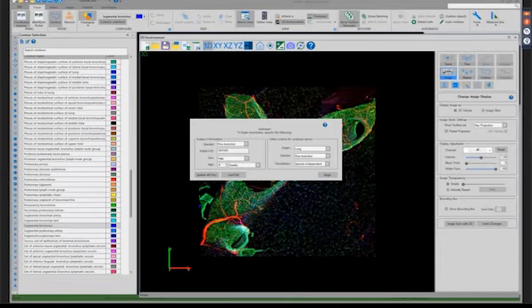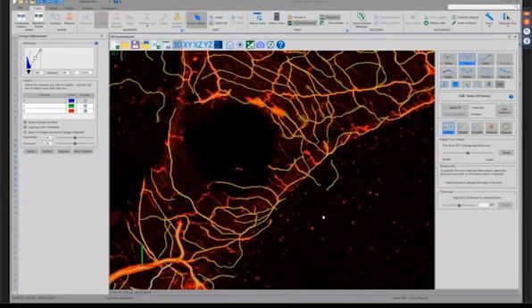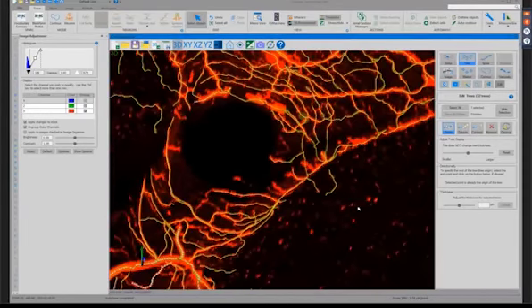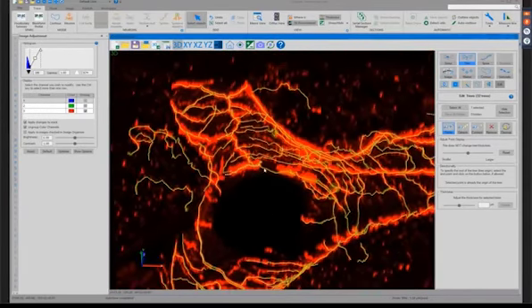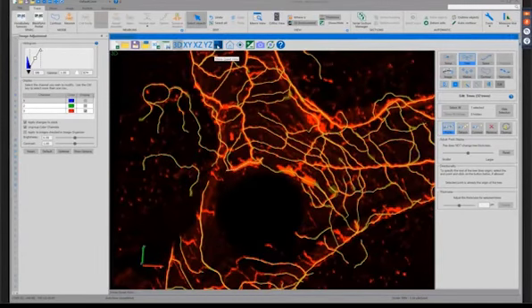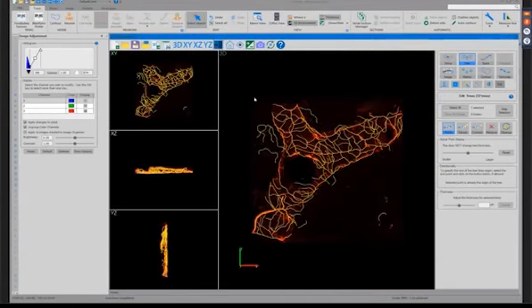I have another question. Does the tracing work showed on the 3D window allow us to see the Z position of each point? Definitely. In the 3D environment, you can just hold your left mouse button and move the image data, and you can see in 3D space where those points are. You can also use things like the quad view, which will show different projections of the data.